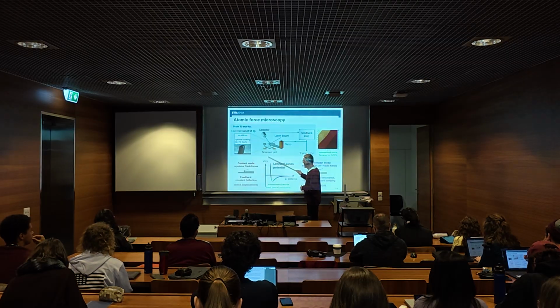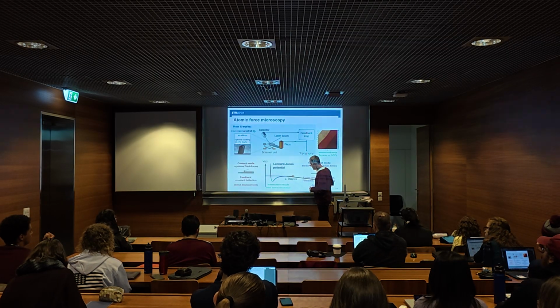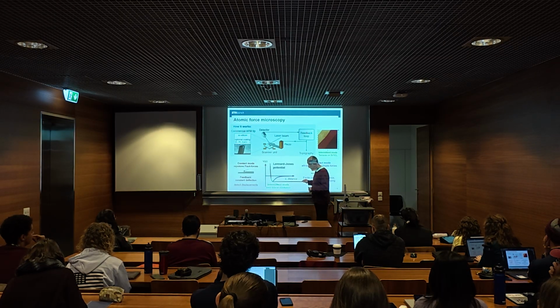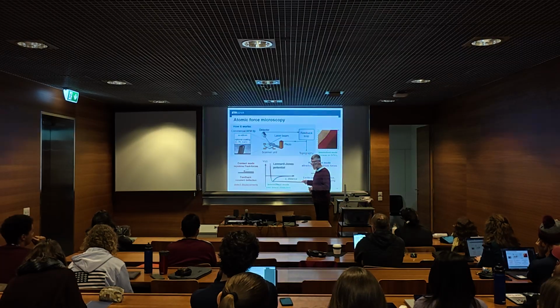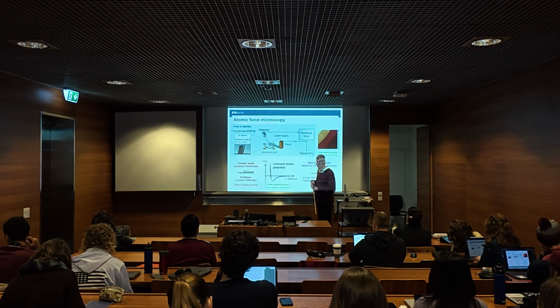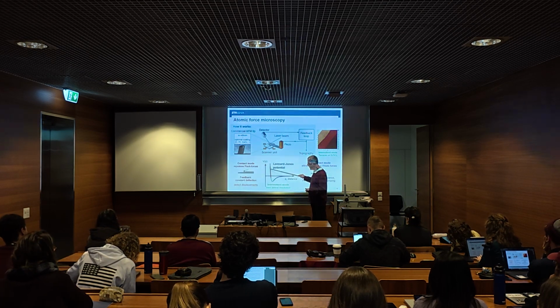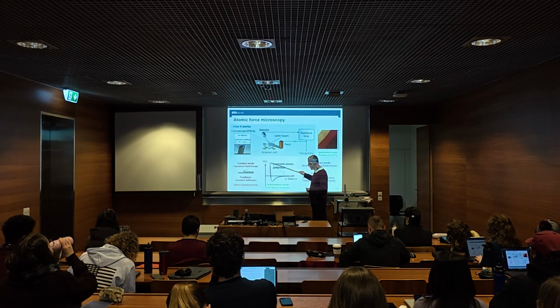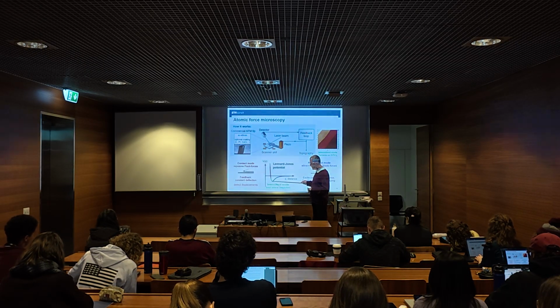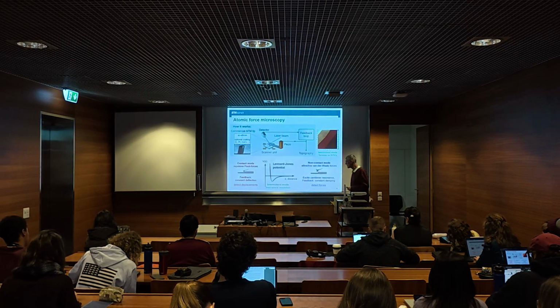So if it's atomic force microscopy, you have the Lennard-Jones potential, so when the tip comes closer to the surface, at some point it will be attracted. And then what you could basically say is when it hits the surface, then it's very strongly repelled. So it cannot really penetrate, so if you try to force your tip into the material, it feels very strong atomic forces, and then suddenly it will not really go in that direction. So there is this narrow potential of maximum attraction, and the entire thing then is called Lennard-Jones potential.